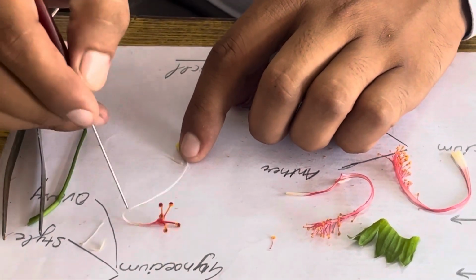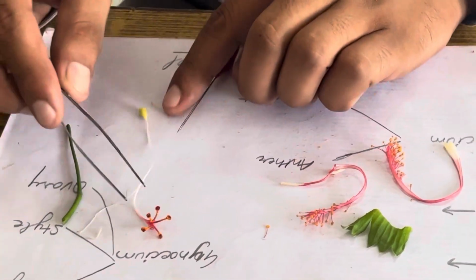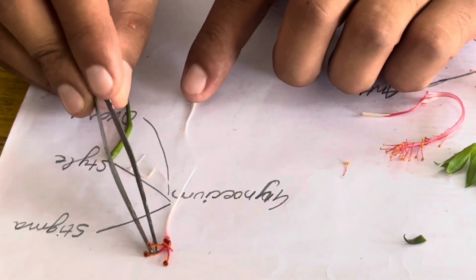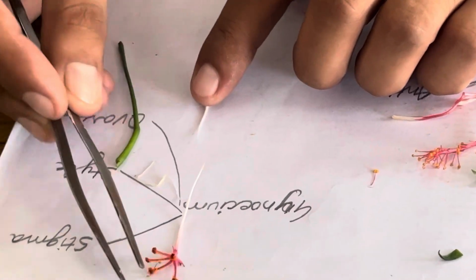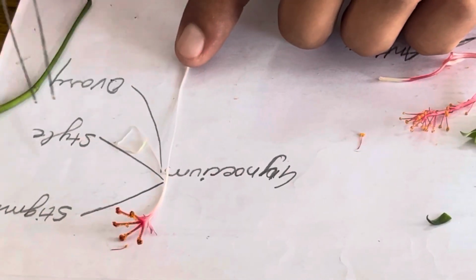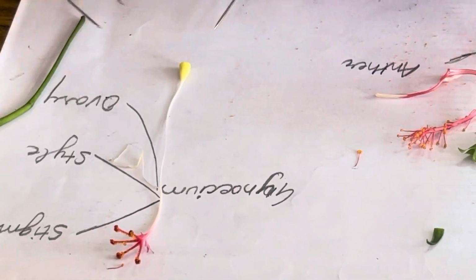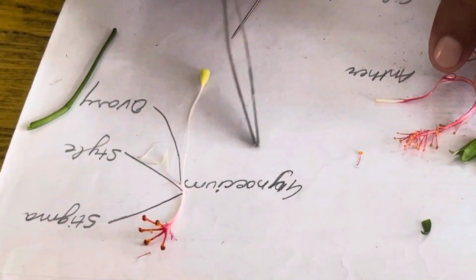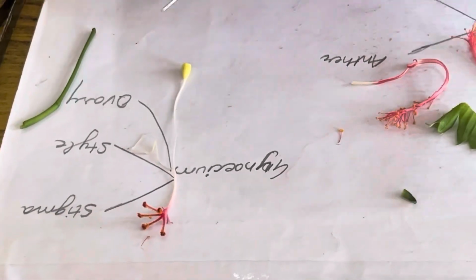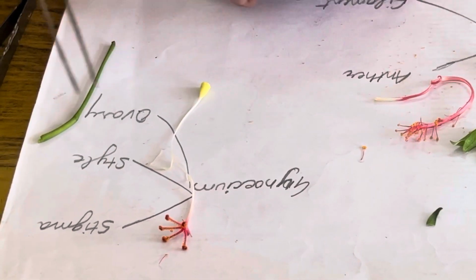In this module we have observed these sticky appearances, which are the stigma. The stigma is covered with pollen grains, hence pollination occurs, right? The second part is the style, and the third part is the ovary. In this module the gynoecium is present. This structure is considered the stigma. You can observe, this is the stigma, this is the style, and this is the ovary.